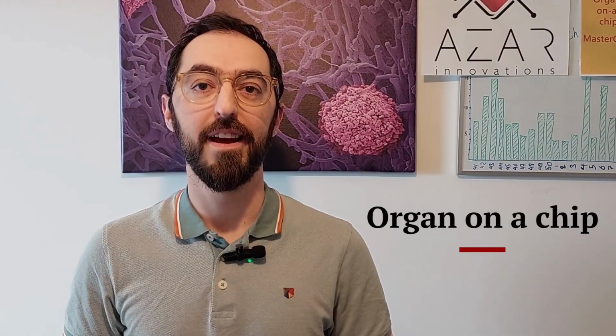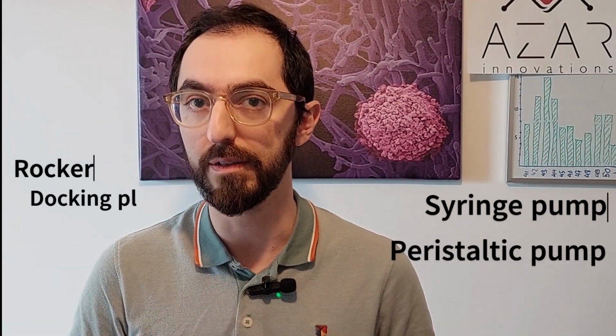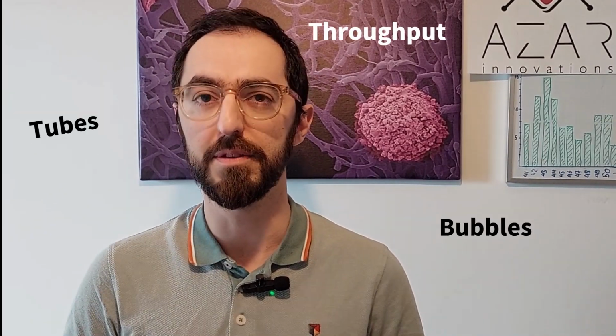Organ on a chip, an emerging field. But what are these chips? How small are they? Also, so many technologies out there, very confusing, right? Some use membranes, some use hydrogels to create a gut barrier. Some use one-path flow, some use recirculation. What are the advantages and disadvantages of these models?